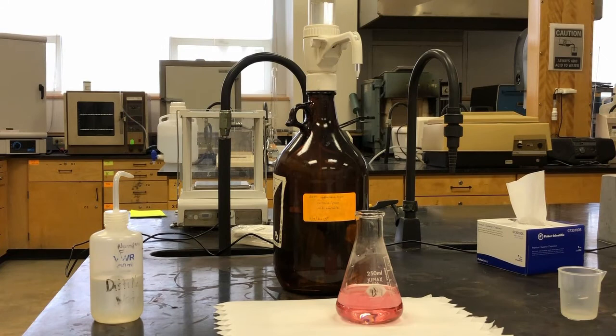So that volume that we added to this flask, that's the volume of the titrant that you're going to use in your calculations. It's the volume of the hydrochloric acid that we had to add to reach the end point. Now I'm going to run the rest of the samples plus a blank, and you will be provided with all of that data to use in your calculations.